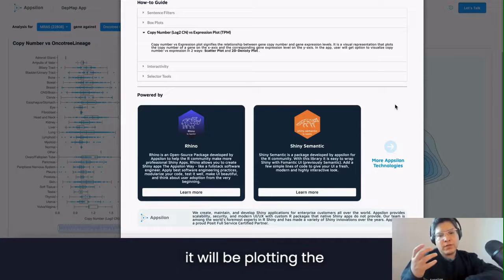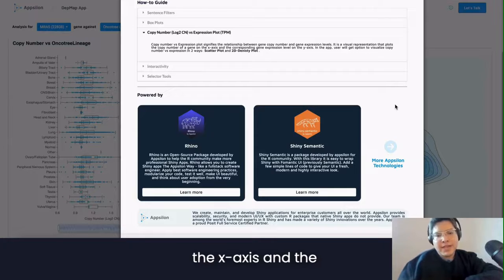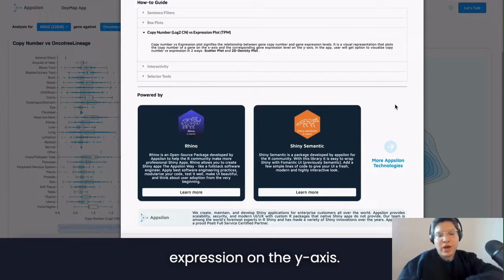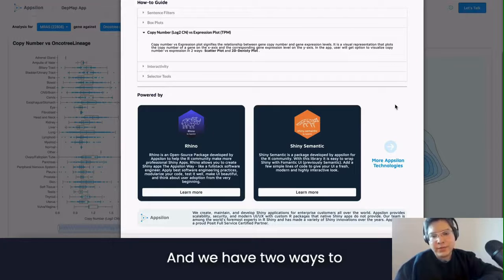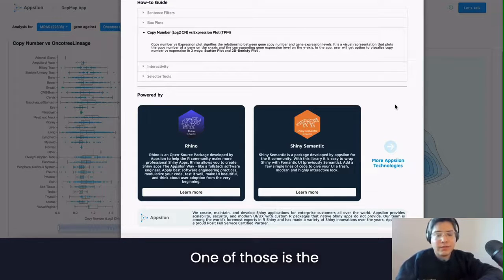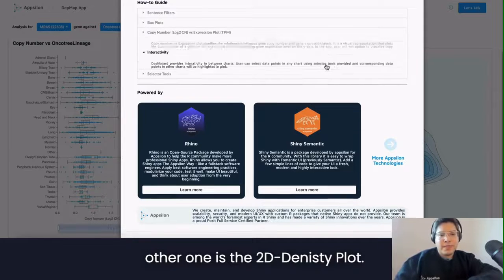This plot of copy number versus expression signifies the relationship between gene copy number and gene expression levels — a visual representation that plots these two. For example, it plots the copy number of a gene on the x-axis and the corresponding gene expression on the y-axis. We have two ways to visualize this: one is the scatter plot and the other is the 2D density plot.